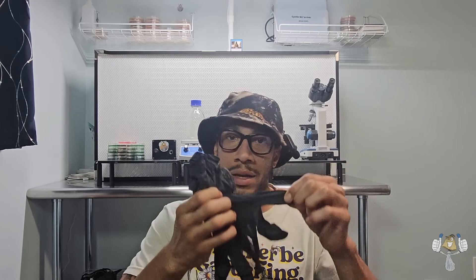Next up: gloves. Gloves are important because our hands hold dirt and oils, and if we start touching stuff in our grow area we're going to instantly contaminate it. Gloves must always be worn from the very beginning of our grow to the very end. These are our powder-free regular black gloves.